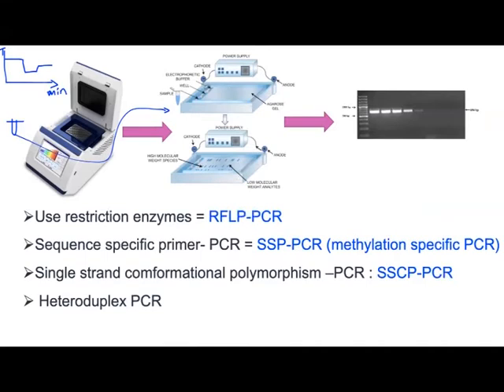Some people use agarose, and after the agarose, you need a camera to detect the products, the PCR product that has been formed because of amplification. This requires a lot of time. It is labor intensive and time consuming, and it can be painful for the people working in the lab if you have so many samples, like 100 or 200.